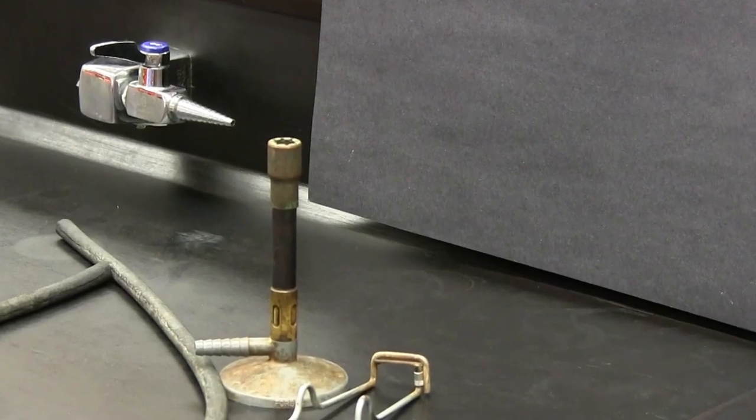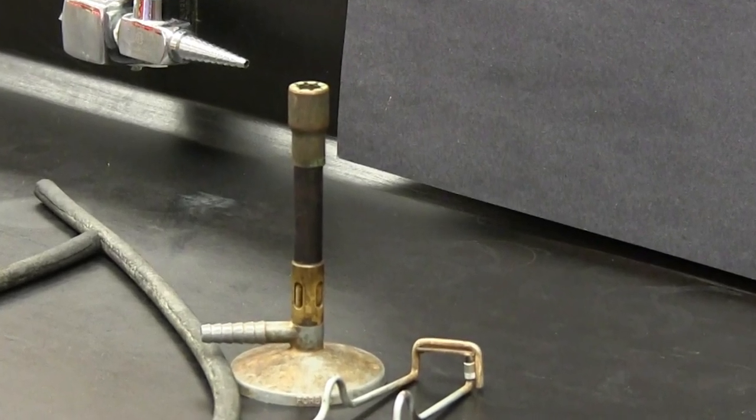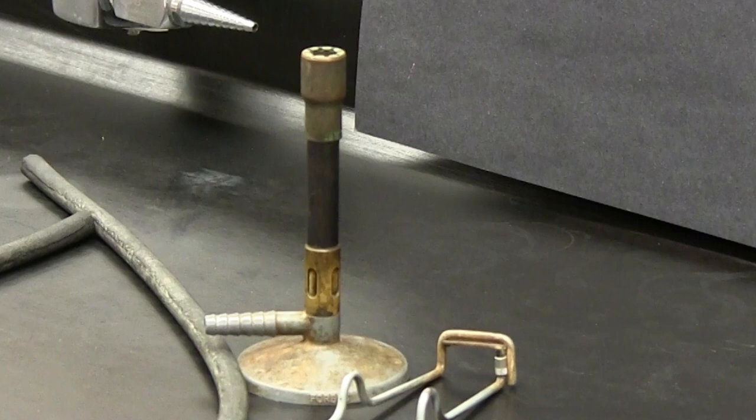This video provides a quick look at the Bunsen burner which is shown here. It's attached to the gas supply using thin wall tubing and gas enters the lower port and rises through the Bunsen where it's ignited as it exits from the top.